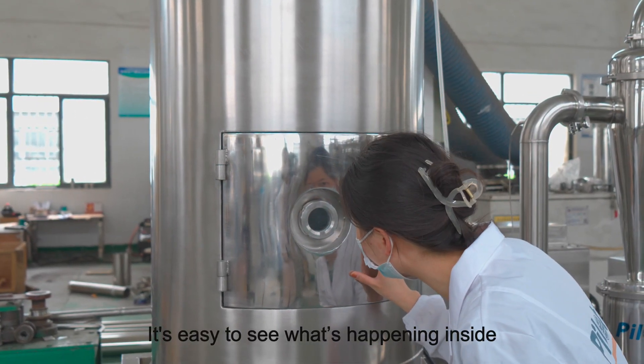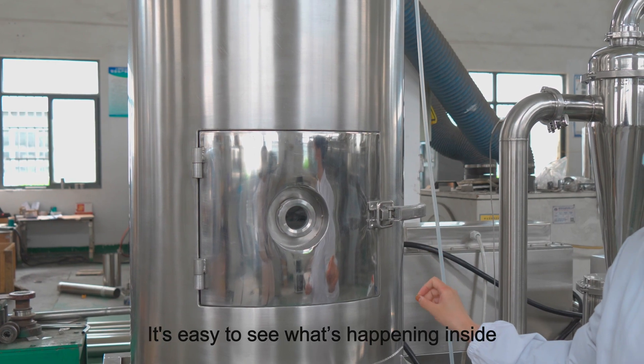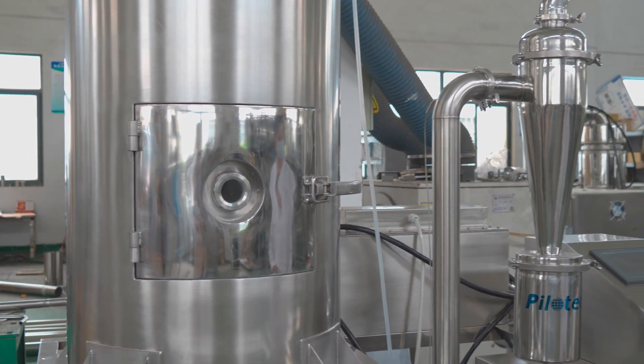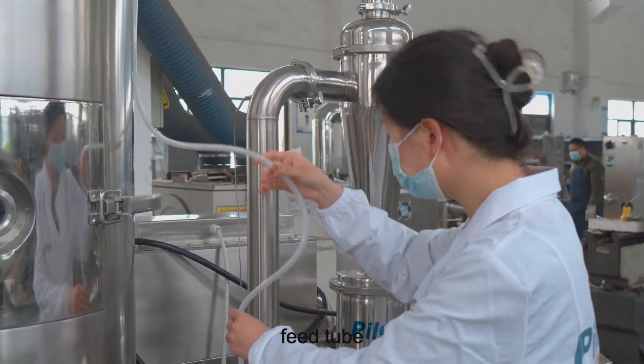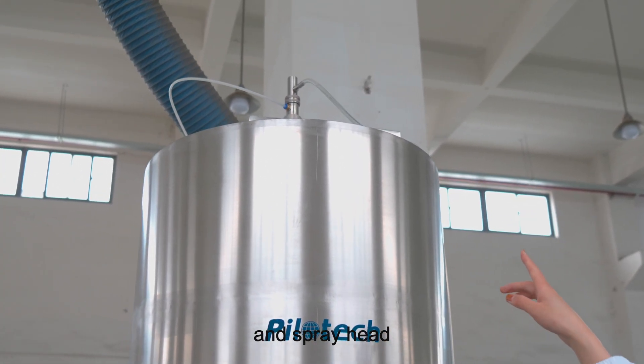It's easy to see what's happening inside. This is the feed tube and spray hat.